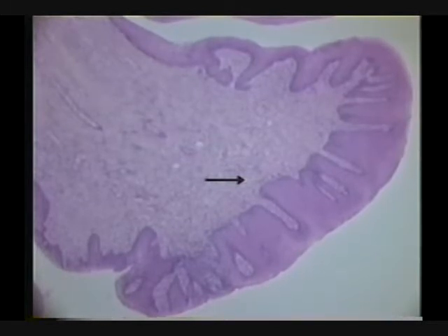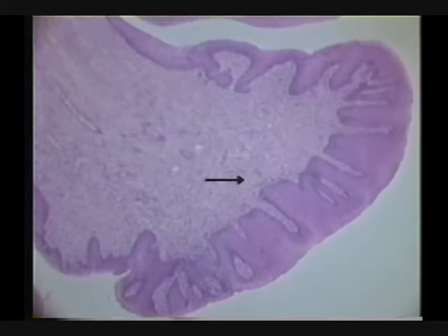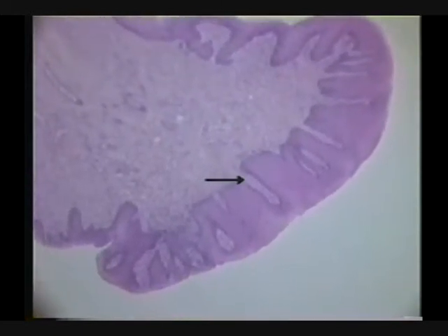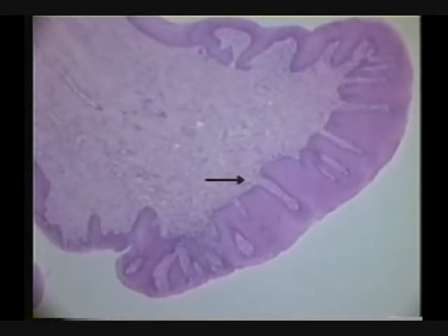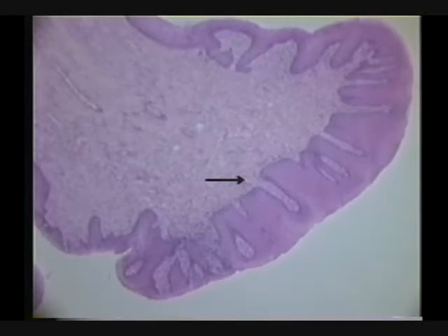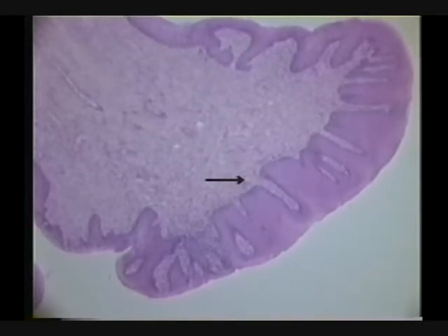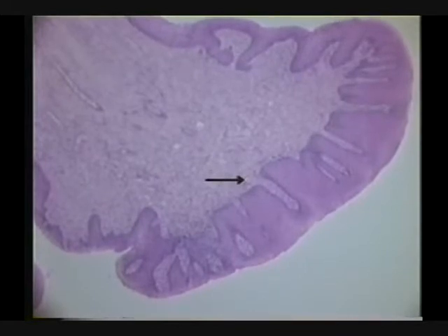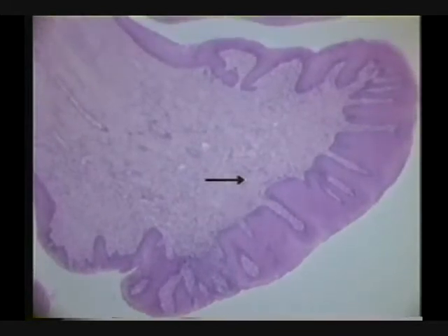I hear it, a circumvallate papilla. And you notice if this is a papilla, can you identify the layer indicated by the arrow? I hear it, it's been the same answer from last semester even. Lamina propria, isn't it? Okay, what kind of membrane do we see in the field of view? Yes, a mucous membrane. And I'm looking at the lamina propria and we're in a circumvallate papilla.